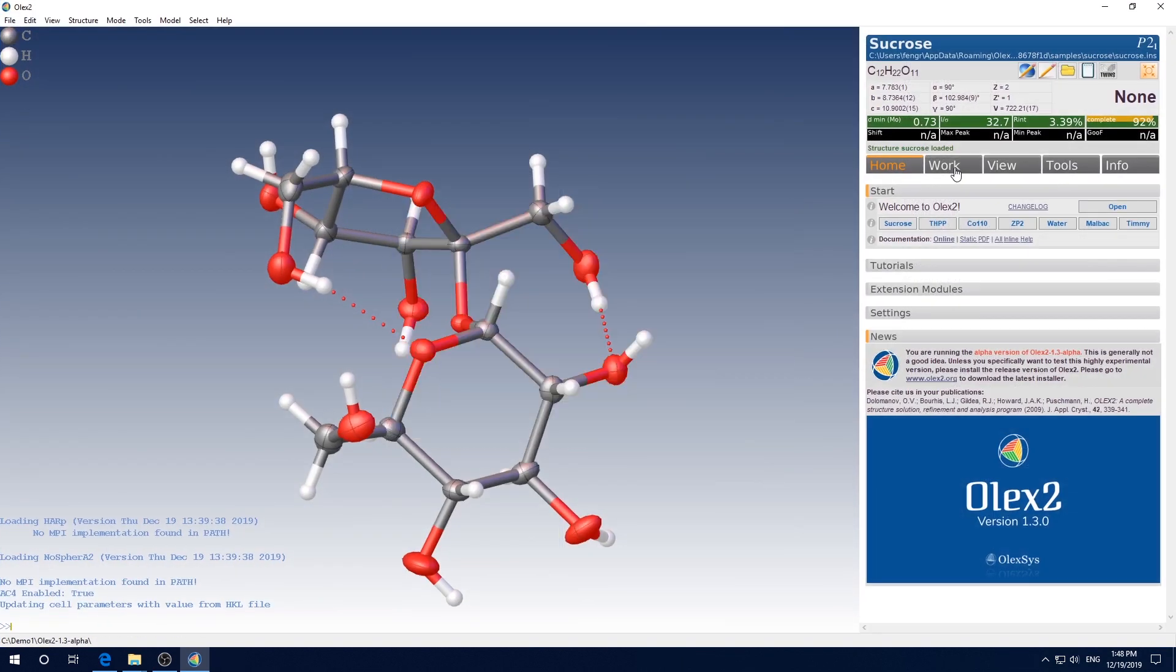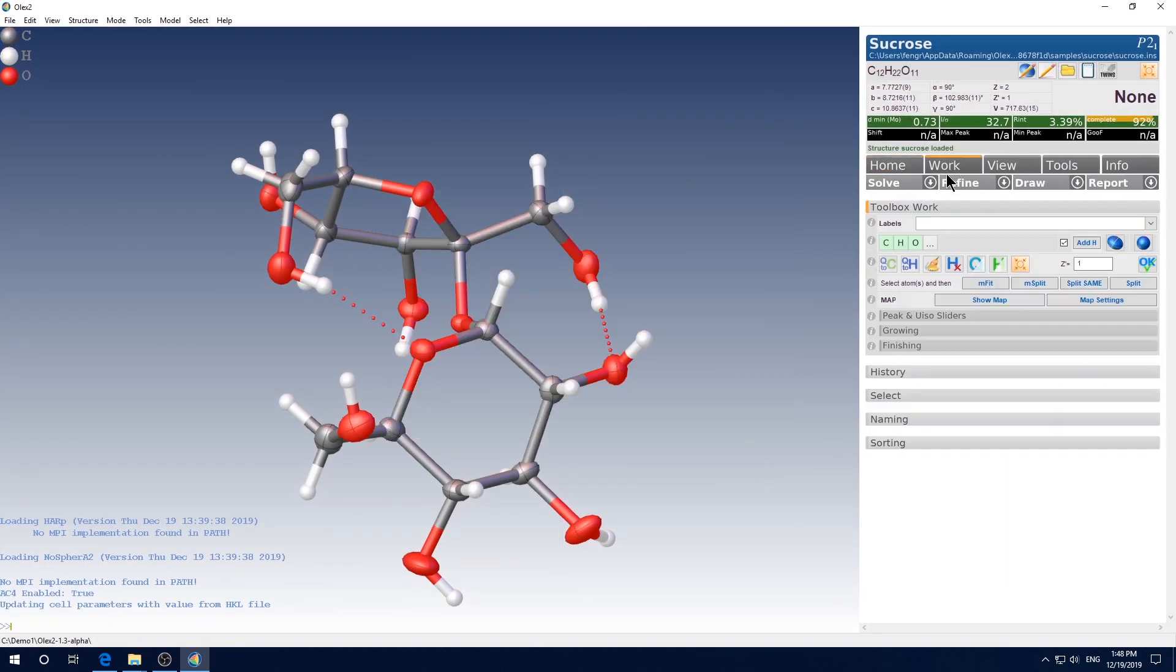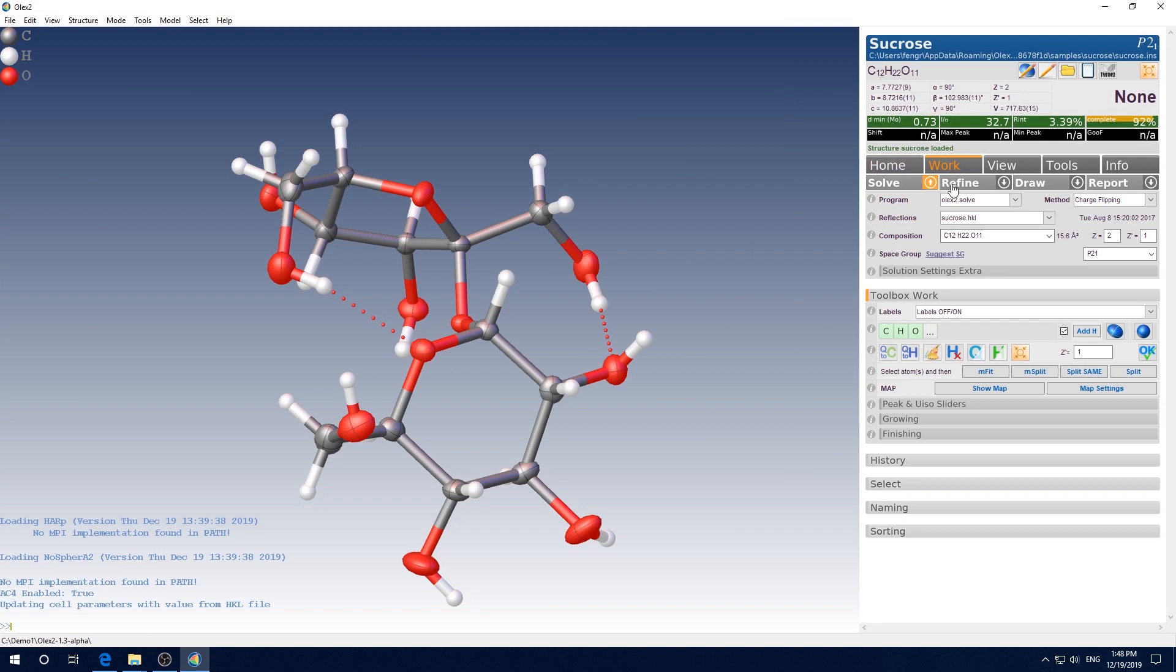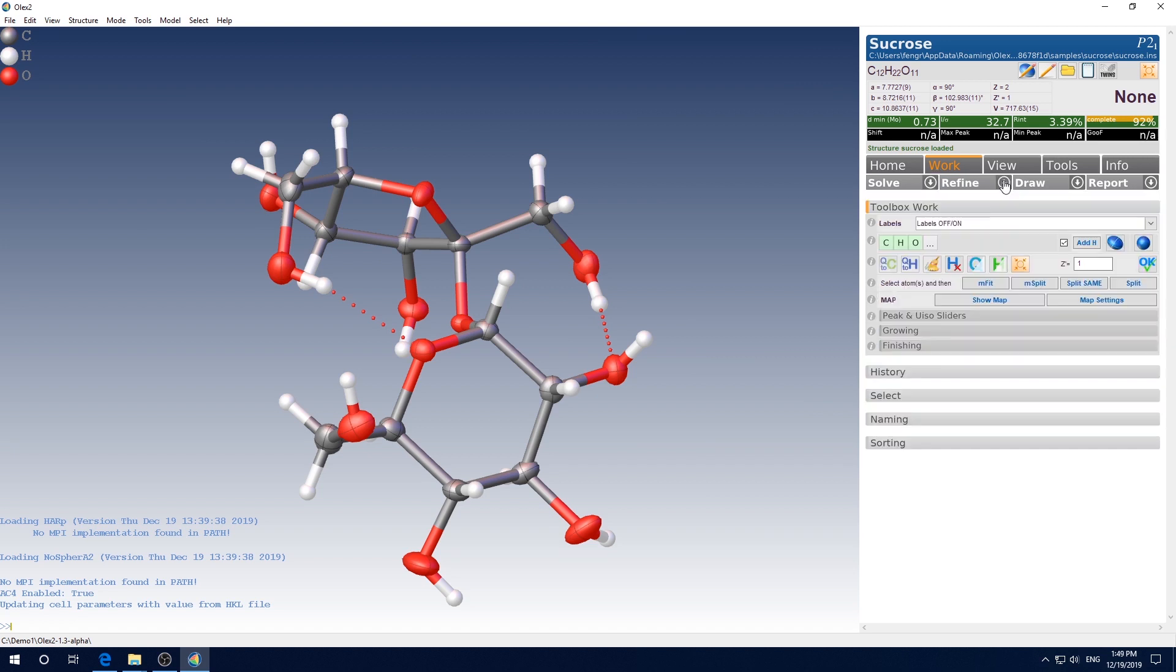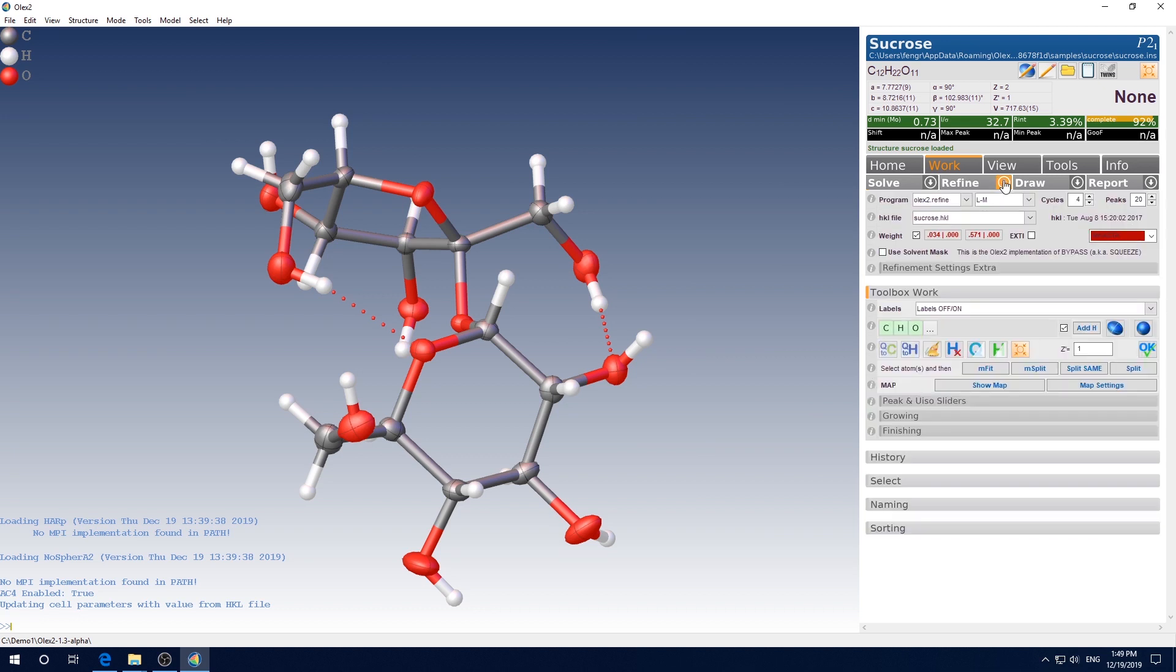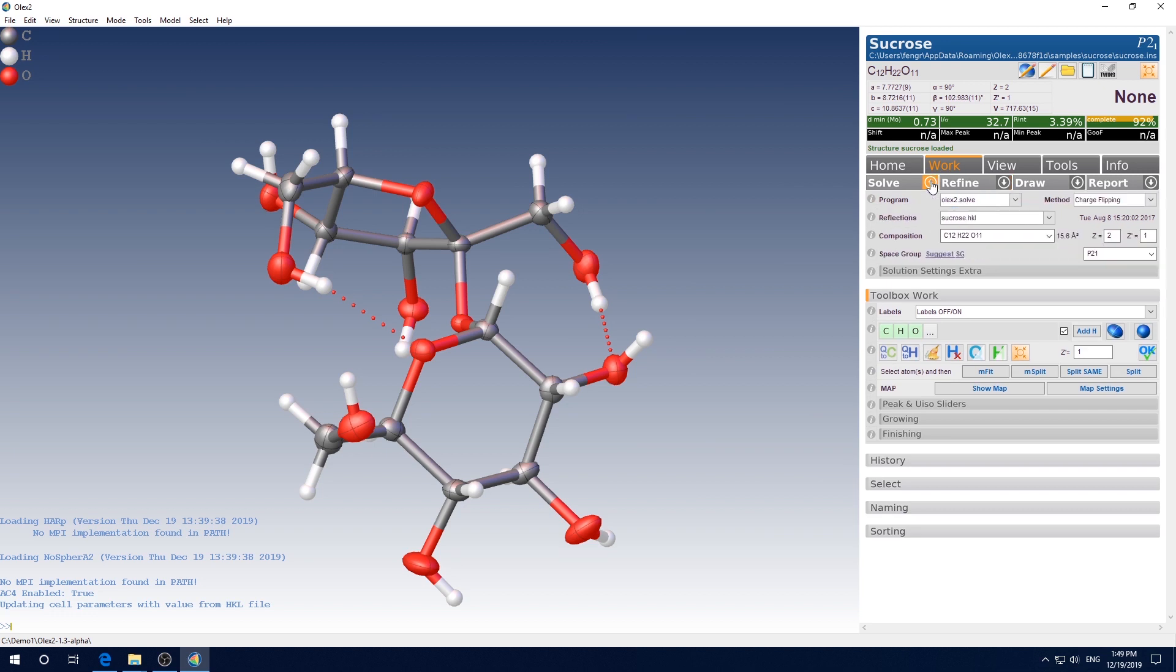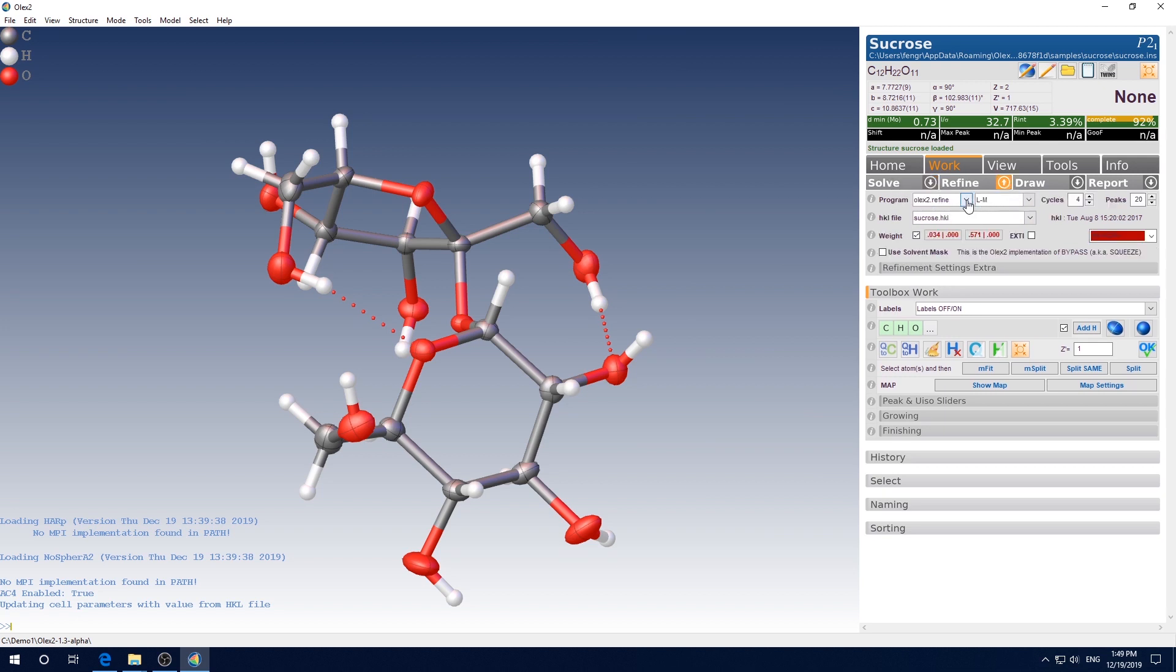You check again. You will see you have multiple options here available. ShellXXT, DS, similarly for refine, you also have an extra choice. You can choose ShellXT for solve program and choose ShellXL for the refine program.